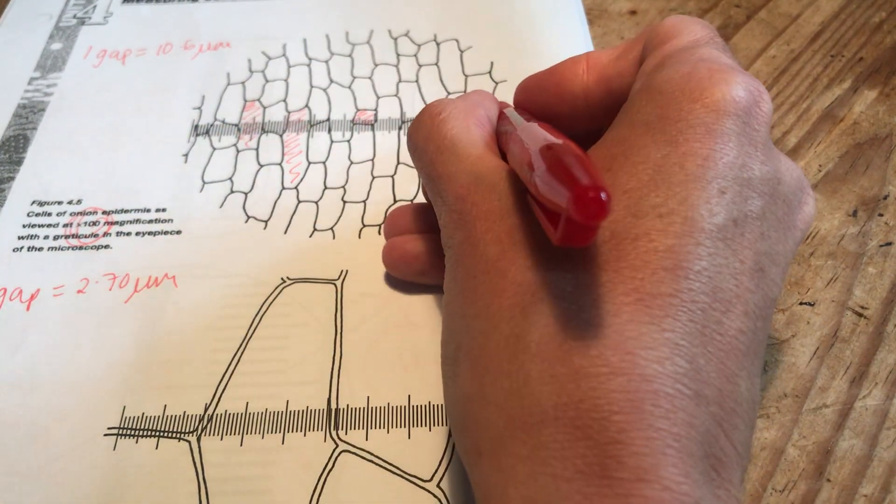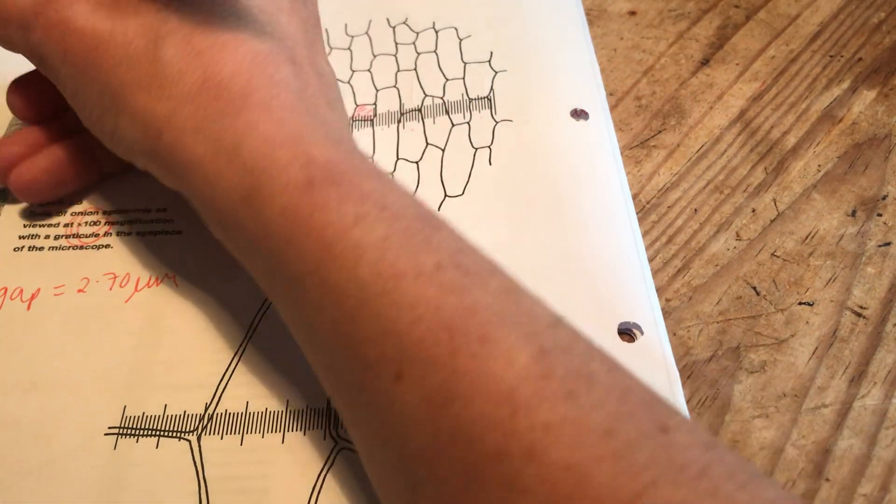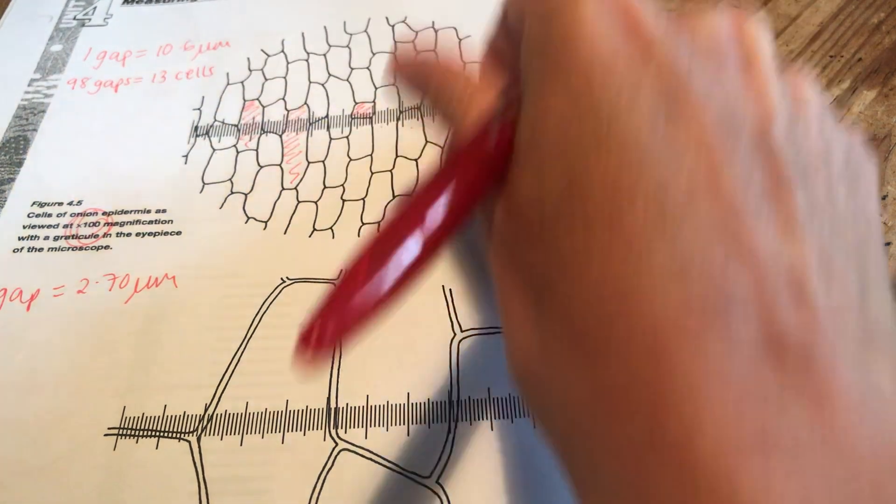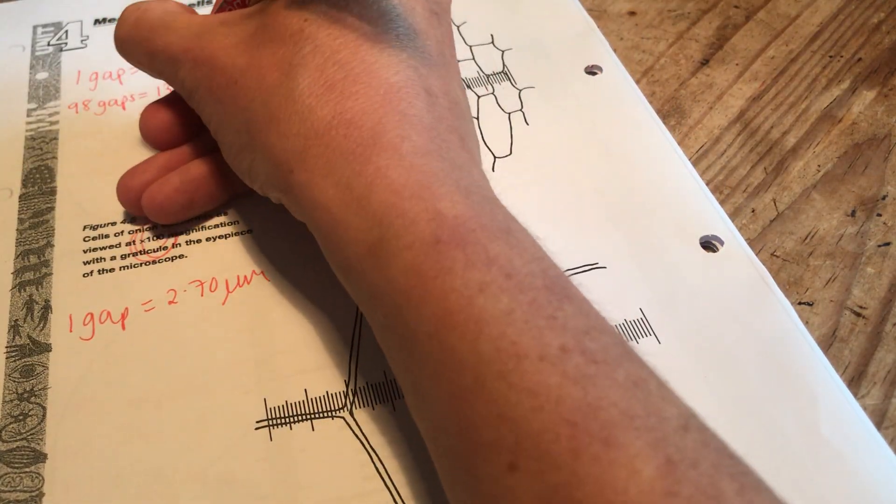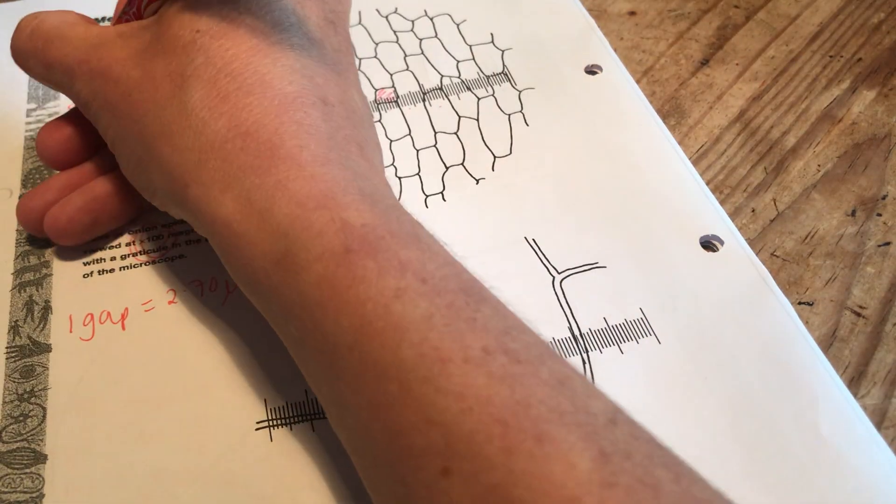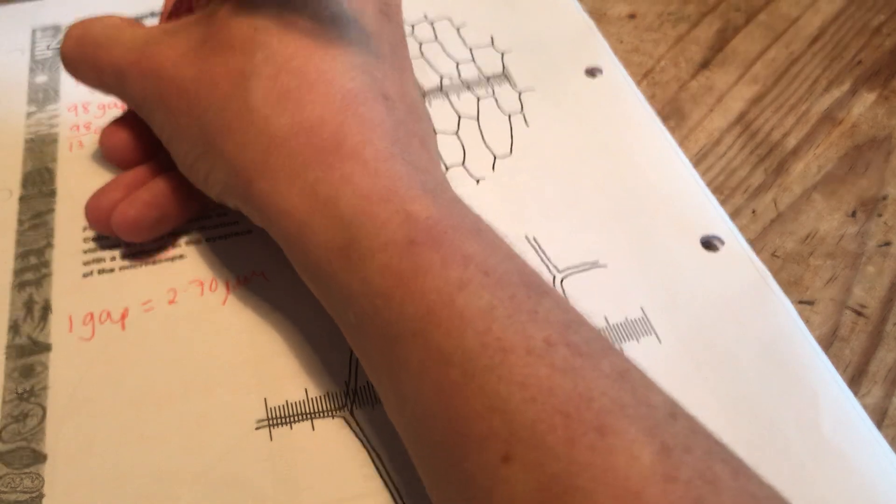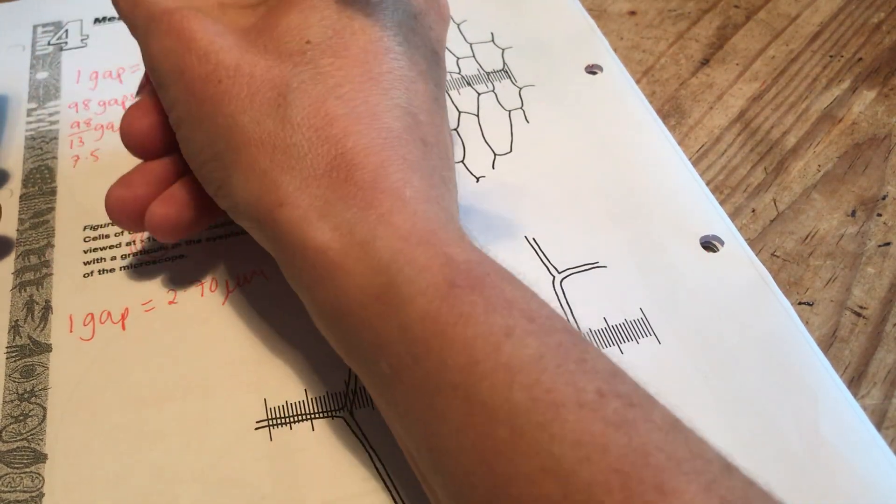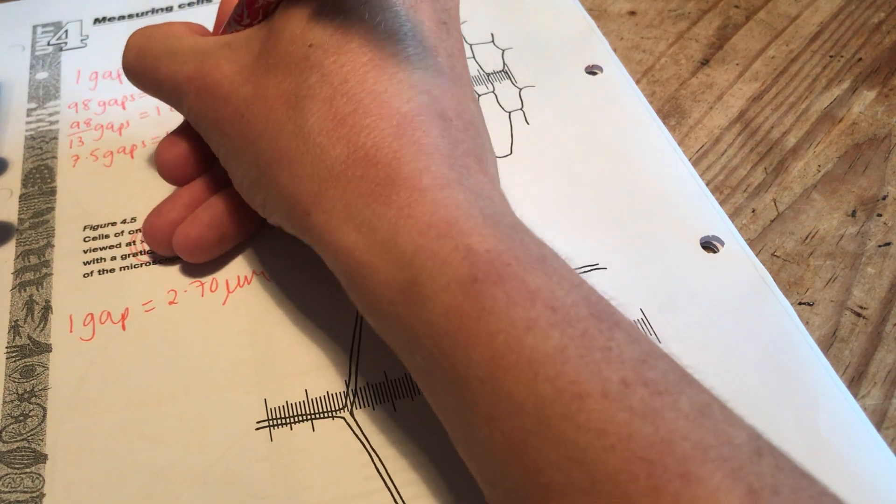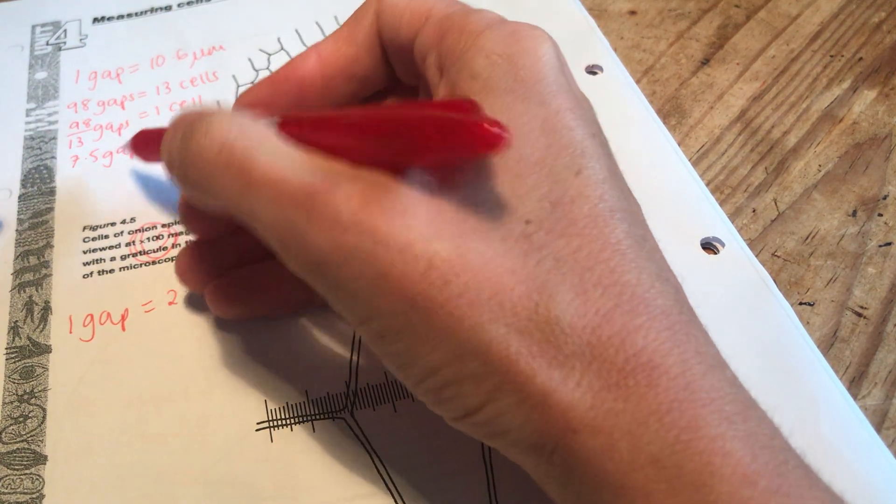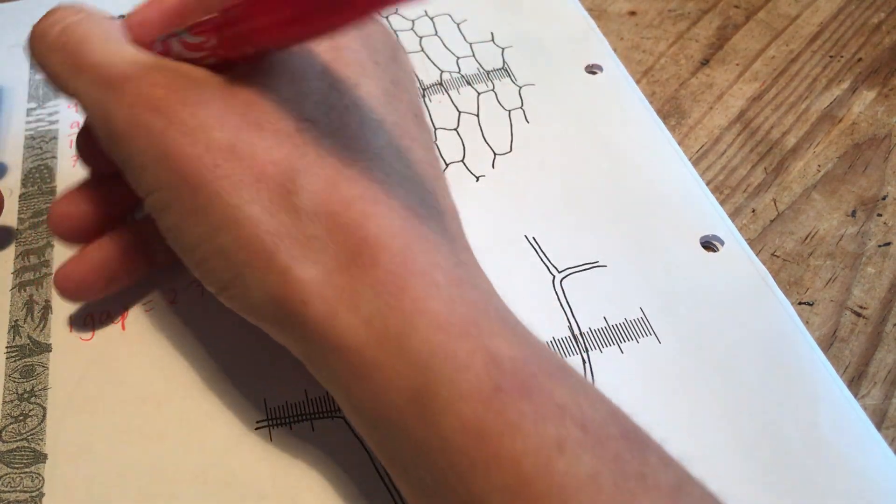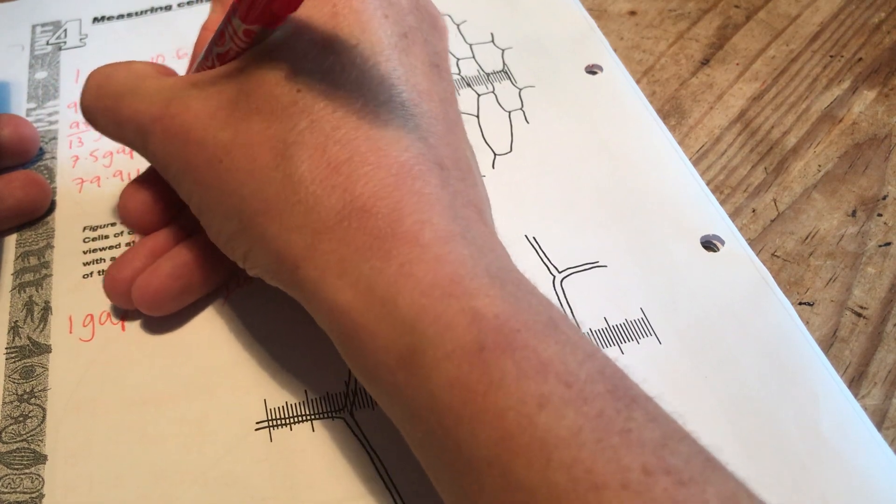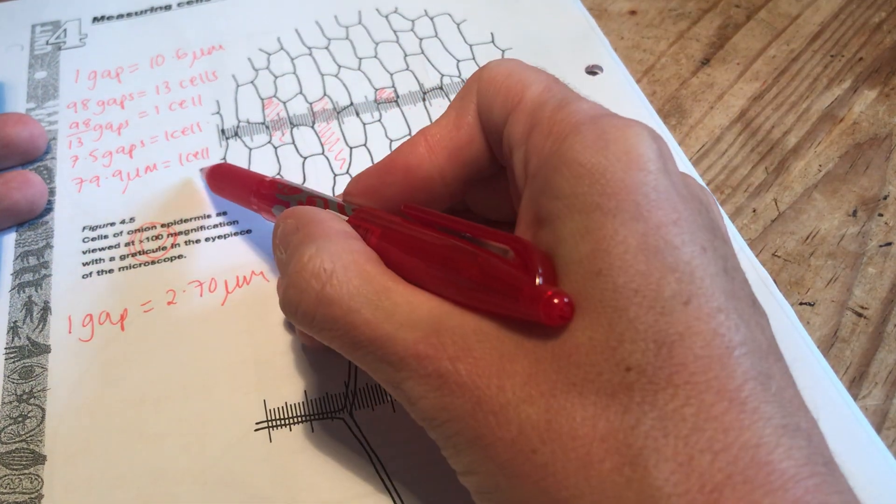Let's say 13 cells fit in 98 gaps. So in 98 gaps, that equals 13 cells wide. So how many gaps is one cell worth? Let's do 98 divided by 13. So you could say each cell on average is worth 7.5 gaps. You know that one gap is 10.6. So if I times 7.5 by 10.6, I get 79.9 micrometers is my average width of one cell.